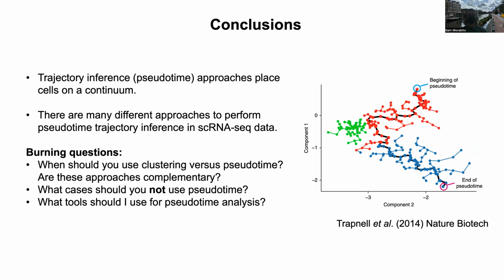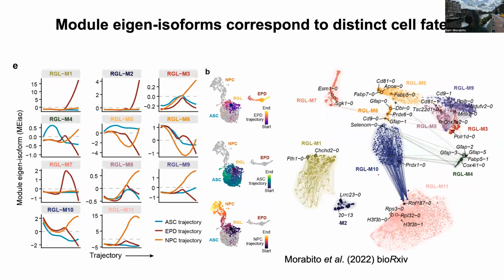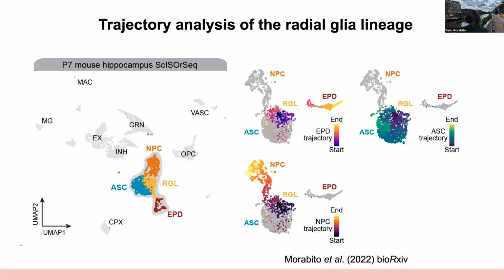I think Monocle can literally just run it. Where's an example? Okay, this is a UMAP on the left, right? There are different clusters, but in the UMAP space there's a couple of blobs: this is one blob, this is another, another one. Monocle does clustering and gives you a cluster ID, but it also gives you something called a partition, which literally corresponds to a separated blob in the UMAP.